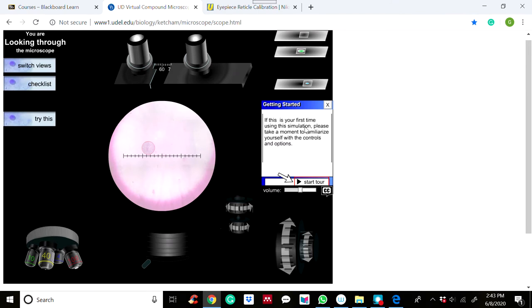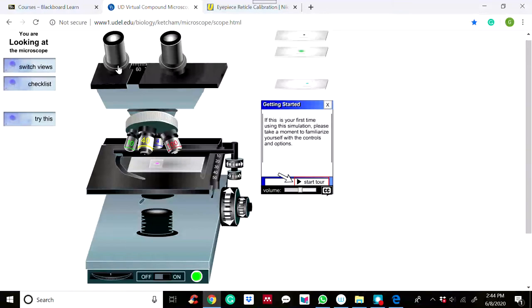A stage micrometer is just like a regular slide, except that instead of a specimen it has a scale — a scale with a known true division length. It is called a stage micrometer because you need to place it on the stage, which is the flat platform of the microscope.